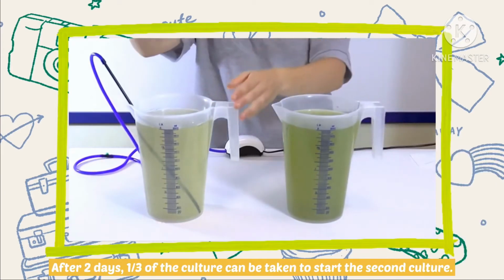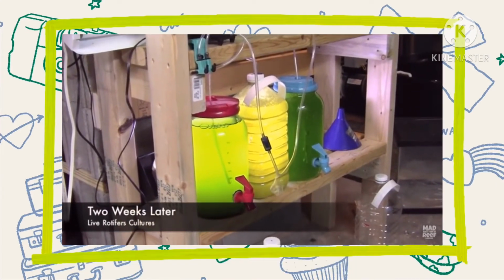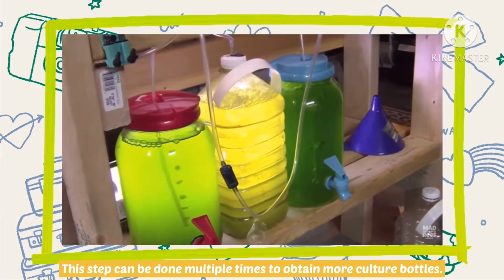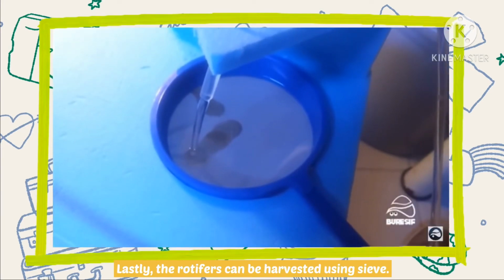After 2 days, 1/3 of the culture can be taken to start the second culture. This step can be done multiple times to obtain more culture bottles. Lastly, the rotifers can be harvested using a sieve.